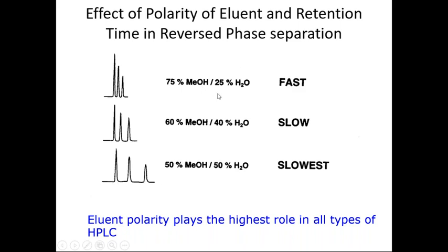When you use a lower polarity solvent, you can get a faster separation. So you see that the separation is very quick. One of the best examples for you to understand is the separation of glucose, fructose, and sucrose on an amide column using acetonitrile water. If you use 70-30 water, you see that you almost cannot get the separation of sucrose, glucose and fructose.